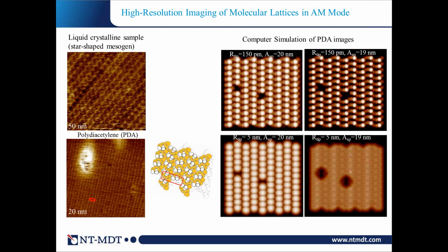Therefore, if you are losing on sensitivity or on signal to noise ratio, you can get help from the low thermal drift because you can scan slower. These images were done with scanning rates around 1 Hertz, even on a very small stage. This is only possible when the drift is extremely low.